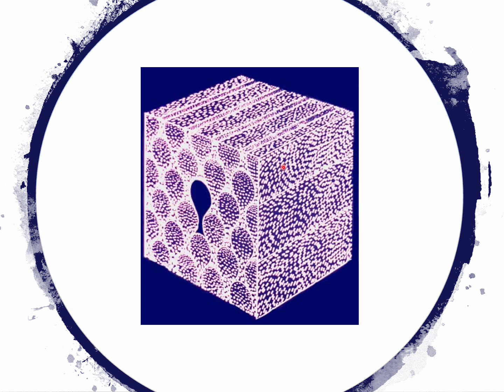and are composed of millions and millions of crystals, which are represented here as dots inside the rods. Millions of them stack over each other to form this beautiful keyhole rod. Why do the crystals arrange in a keyhole shape?